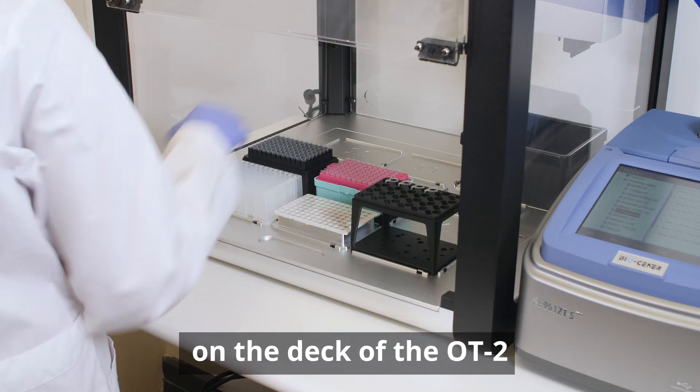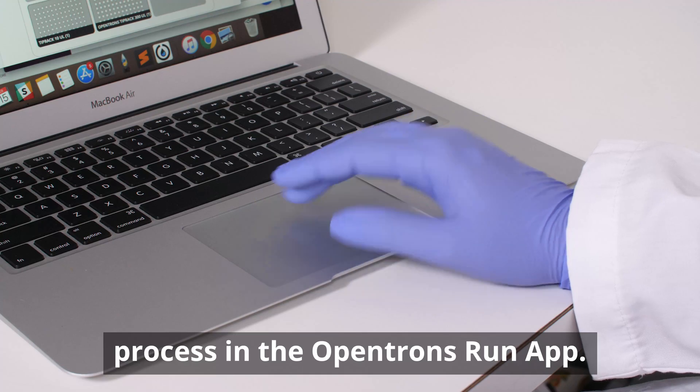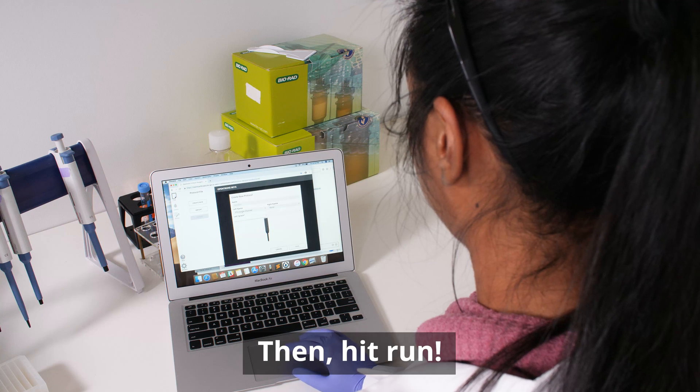Third, place your samples and reagents on the deck of the OT2 and go through this simple calibration process in the Opentrons run app. Then hit run.